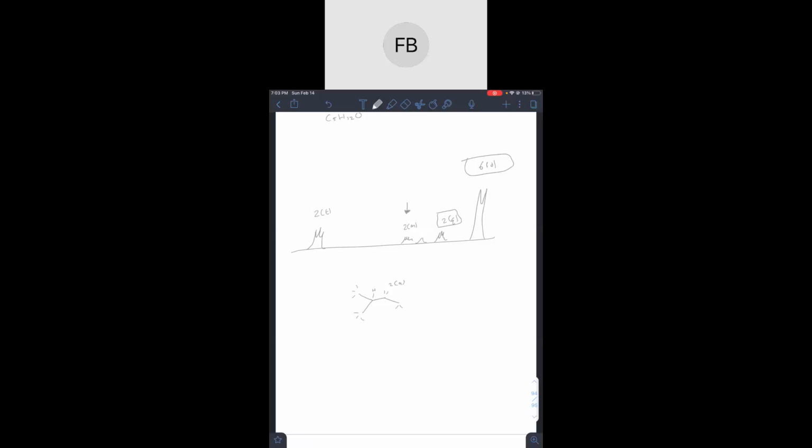That makes sense. From here, let's just review everything we have. So we've taken care of everything. The only thing is, what do you call it? Oh, would you add an OH to that same carbon? Exactly. Because that doesn't mess with the fact that this is a triplet, right? Having this OH, this H here doesn't really mess with it, so that's perfect. So those two hydrogens are still a triplet, which is good. Yeah, the OH, so this H corresponds to this H right here.